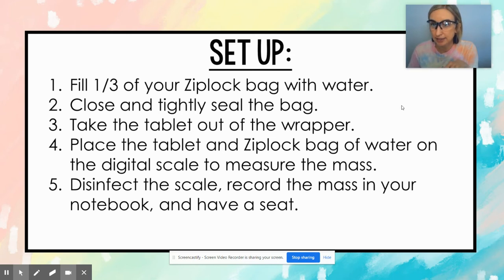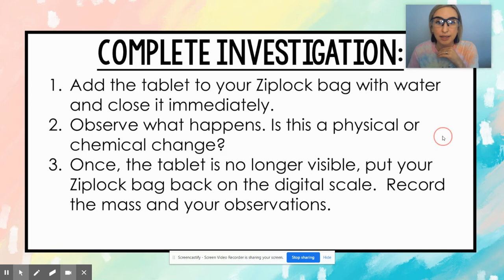Once everybody has that done and we're all back in our seats, then we'll actually go through and complete the experiment. So you do need to be wearing your safety goggles at all times during this lab. We are not eating or tasting the tablet, so make sure that is not happening. If anyone has any issues following safety, you will sit out during this experiment. So make sure you've got your safety goggles on and you're not tasting or eating this.